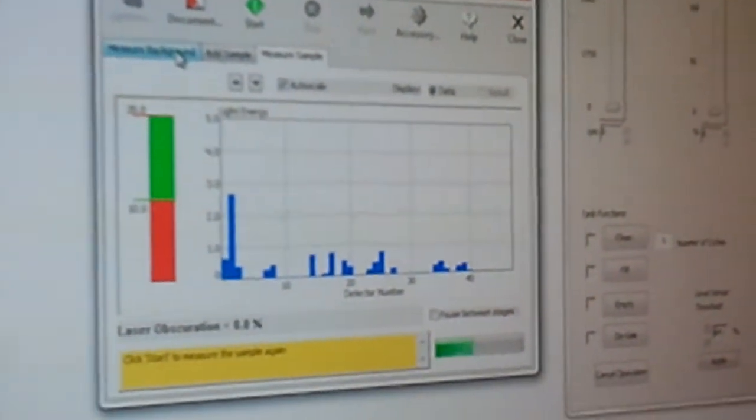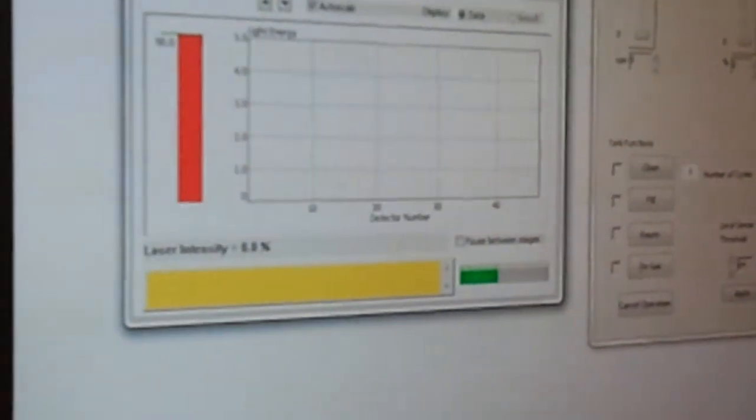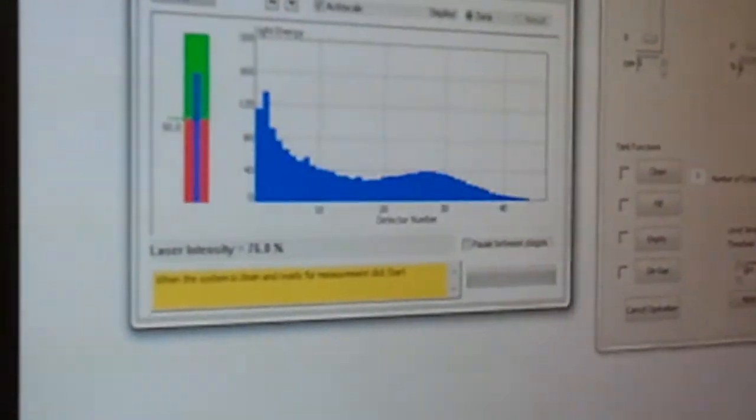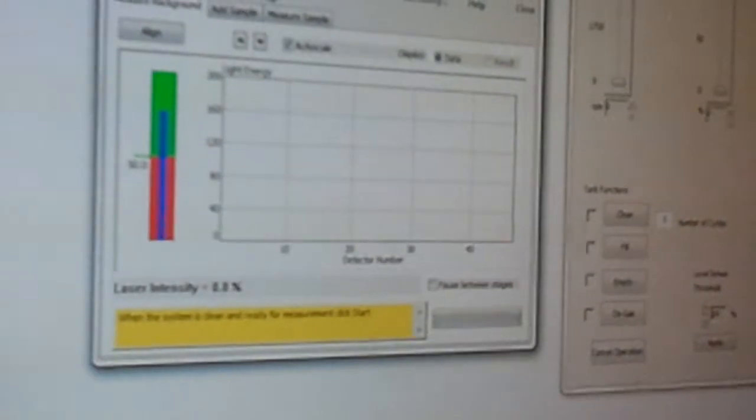Let's go back to measuring the background. Yep, and then we start.